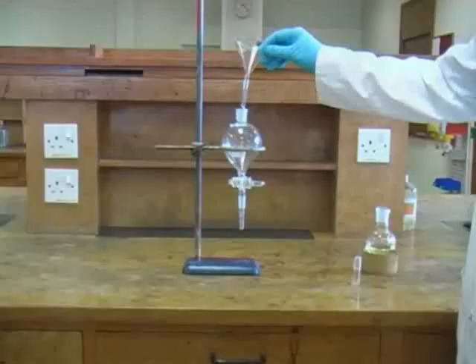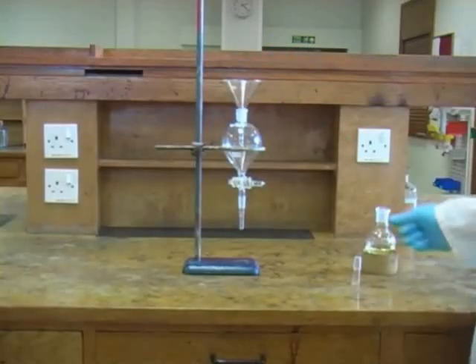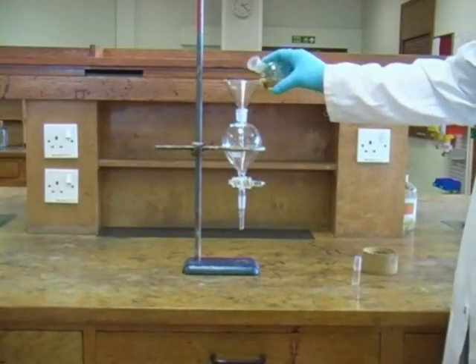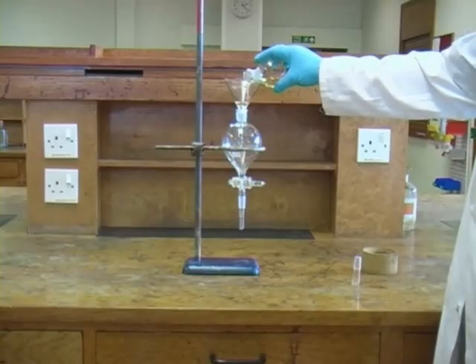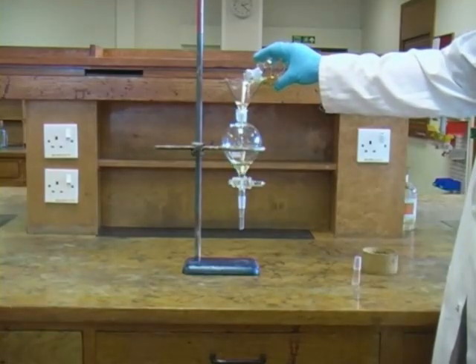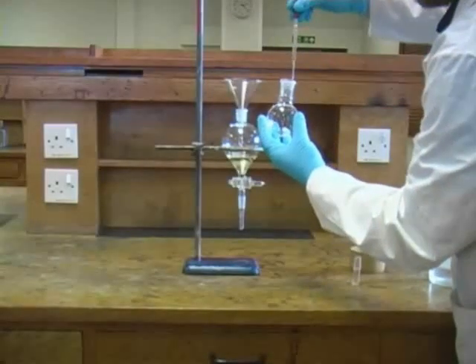We now need to pour the solution of our product into the separating funnel, taking care to avoid any spillages, so it's wise to use a small glass funnel as we pour. Then we can rinse our reaction flask with more ether to ensure that no product is lost.